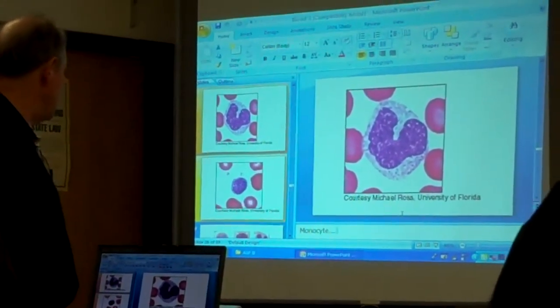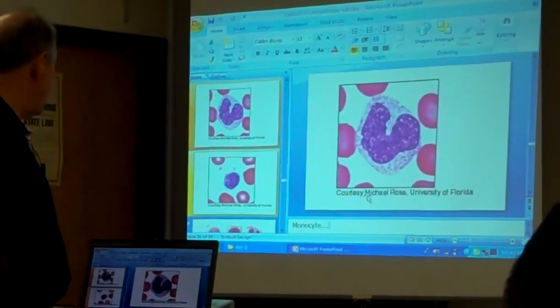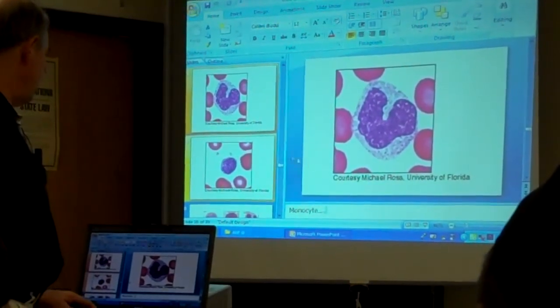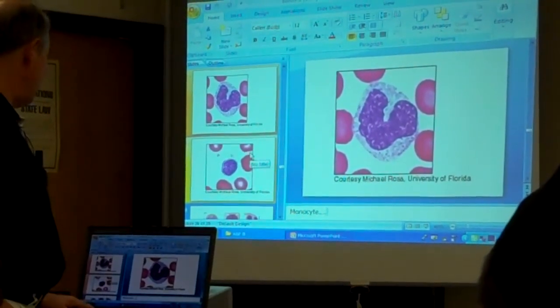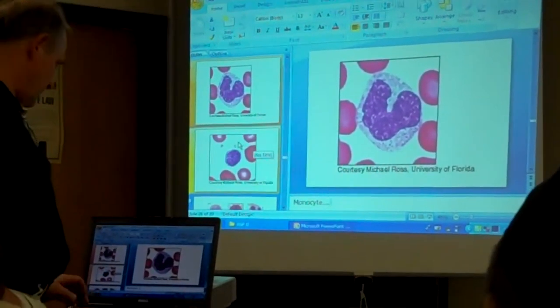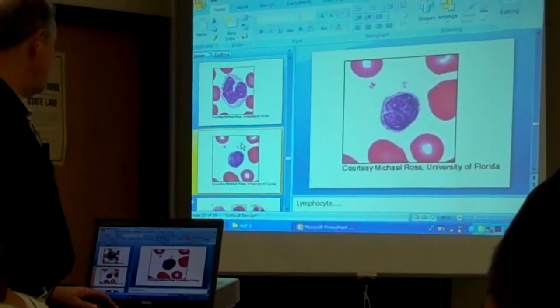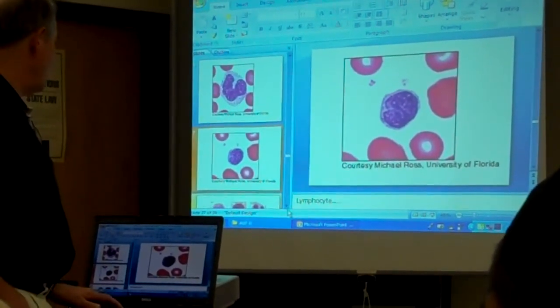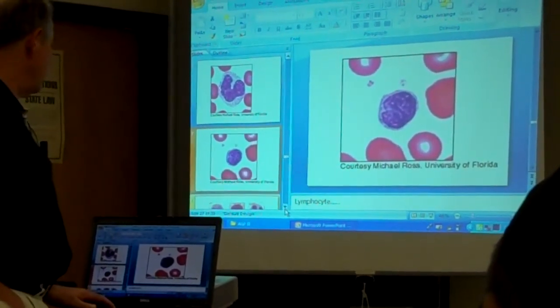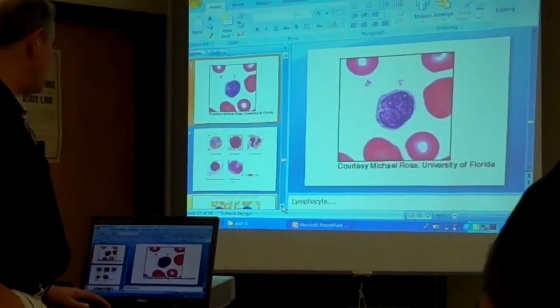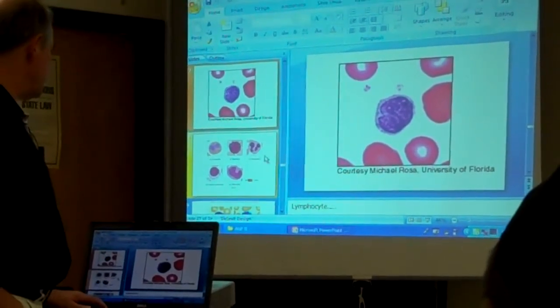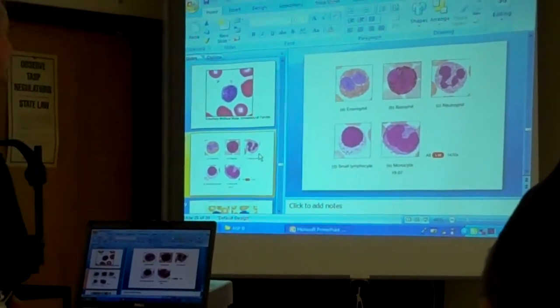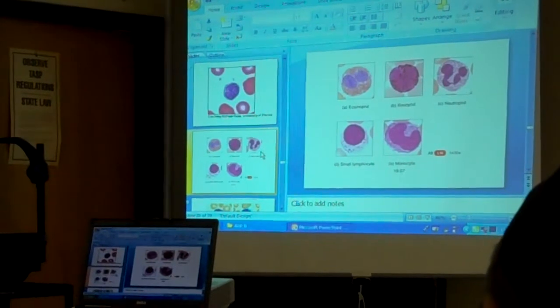Then if we go on down, that next one is going to — most likely — that's the way a lymphocyte looks. There's a lymphocyte. And then here the whole group together, these white blood cells — eosinophil, basophil.